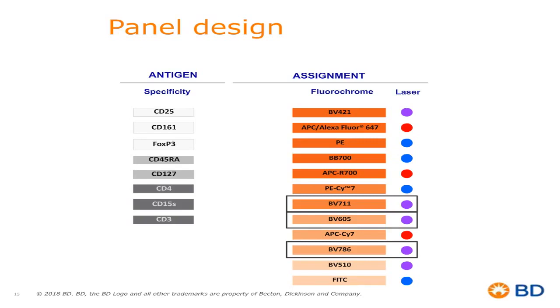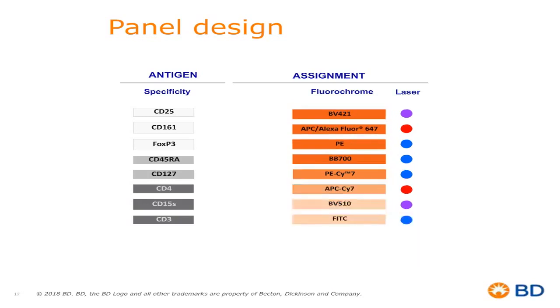So when I want to save another fluorochrome, I want to think about it to make sure that I have the best utility and versatility for my drop-ins. I already have a number of fluorochromes that are moderately bright, so I'm just going to choose in this situation APC-R700 because it's a little bit brighter fluorochrome. So without those fluorochromes being available, I now have my list of available fluorochromes to build my common backbone, the common core to my modular panel.